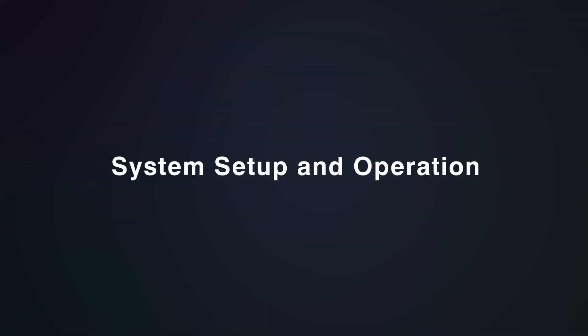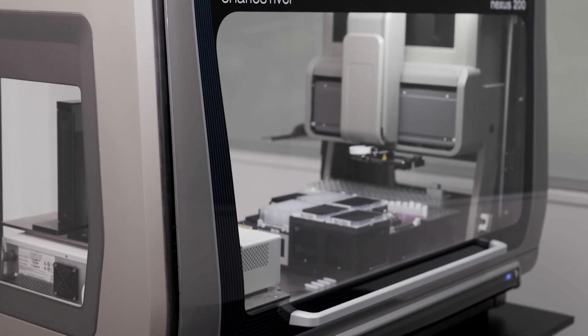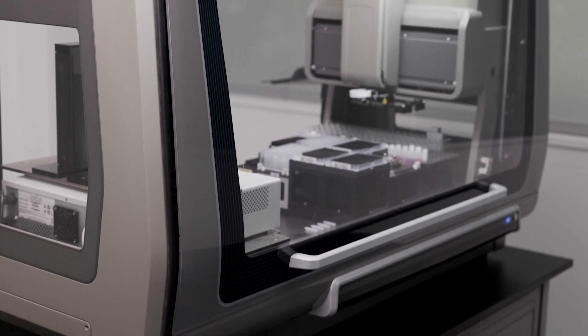As a fully enclosed automated liquid handling platform, the Nexus 200 contains all the necessary elements and components to perform your endotoxin testing.